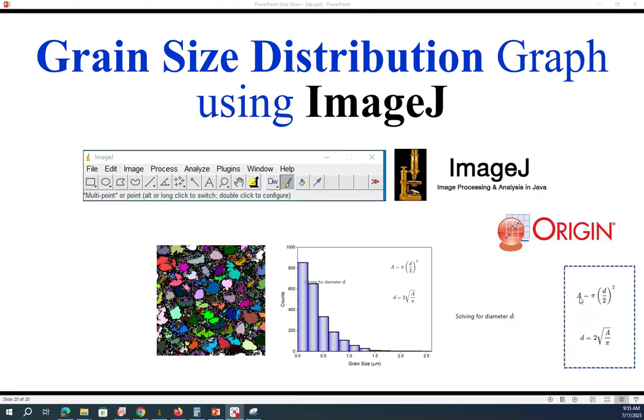We know that these look like circles, though they are not exactly circles, but the formula for the area of a circle is equal to pi r squared. R is the radius, which is equal to diameter divided by 2. If we solve this equation for d, we get diameter equals 2 times the square root of area over pi. We will use this formula to calculate the grain size diameter. So let's get started.